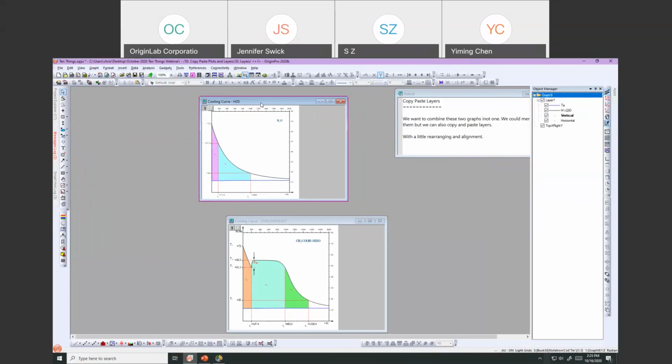I'm always trying to drag and plot, but it never works. Maybe because my graphs open in their own window when I plot a graph. How do I make graphs show up in the same window as the workbook so I can drag and plot?